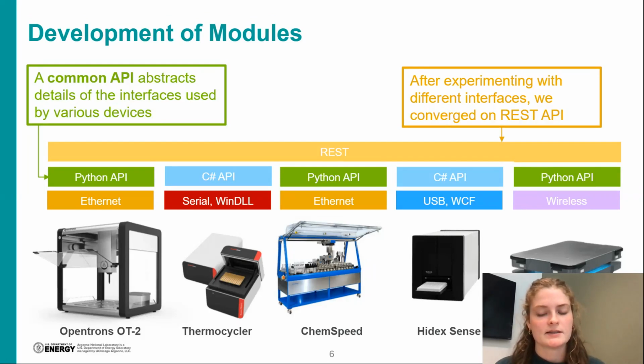Another thing I'd like to say is I think a good way to visualize the difference between the driver and the client is with a robotic arm. A lot of robotic arms in the driver that the company provides, you'll have access to pretty much every motion that robotic arm can do. So, open, close gripper, move to this location, move along one axis, all these different commands that you can access.